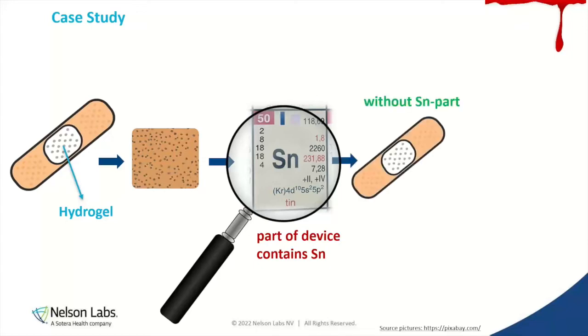So what we did is we were able to peel off that tin layer on the back of the hydrogel. So we were able to remove the cytotoxic component, and that tin layer doesn't have patient contact because it sits above where the patient's only being contacted on one side with the hydrogel. So that was able to help us get those passing results. So ta-da, this would help us escape the room with a risk assessment, like Lisa said, but it would help us get to that passing point.